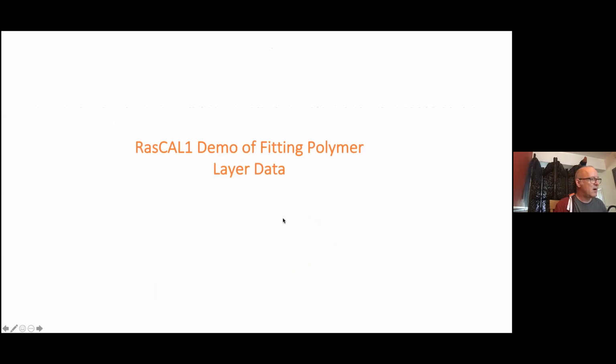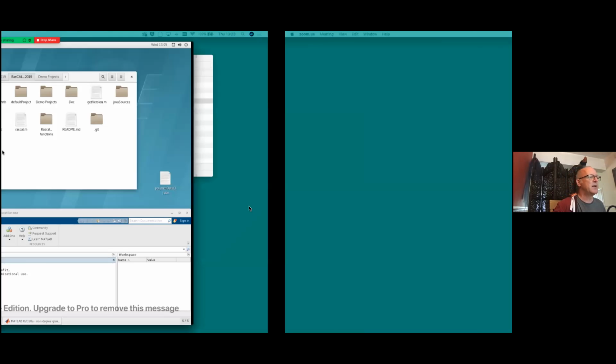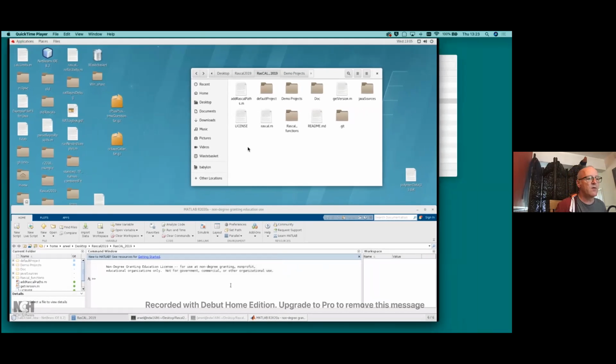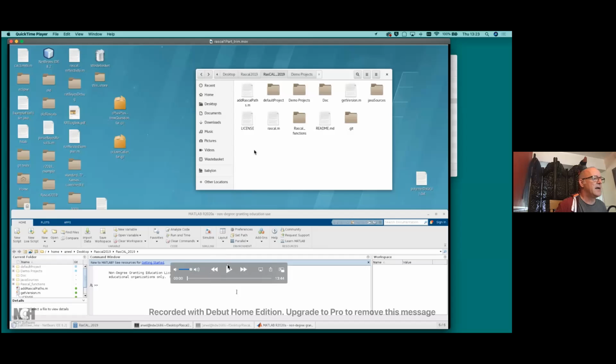Now, I said to some of you, I've had loads of computer problems over the last few days, so MATLAB keeps crashing, and so does my VPN. So I have actually recorded the two demos. We'll do RasCal 1 first, and then we may cut this a bit short. But anyway, here's the RasCal 1 version.